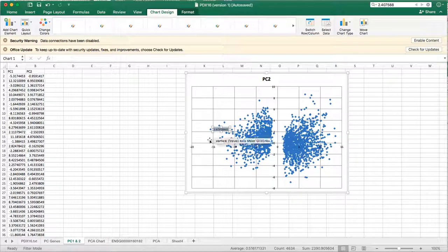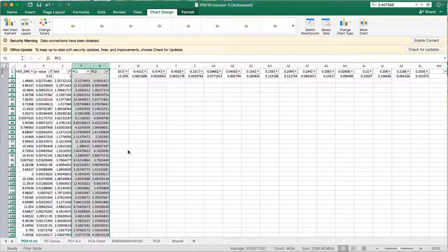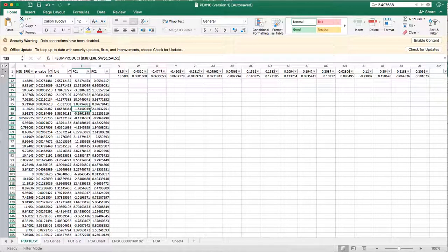And so we're going to copy the coordinate, go back here, and we're going to find it. And it should be pointed out that if you try to use the full coordinate from the graph, it won't find it because it's cutting off your significant digits on the principal components. You can either increase significant digits or just delete a few of these.